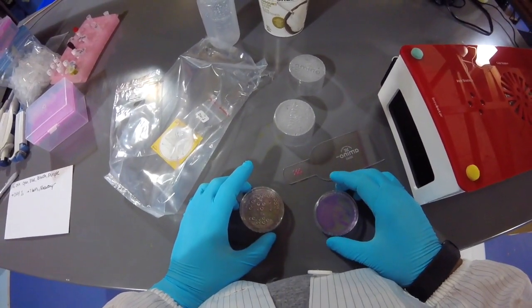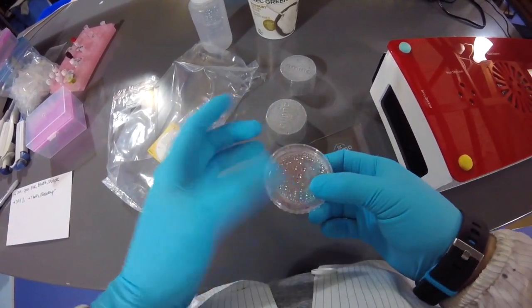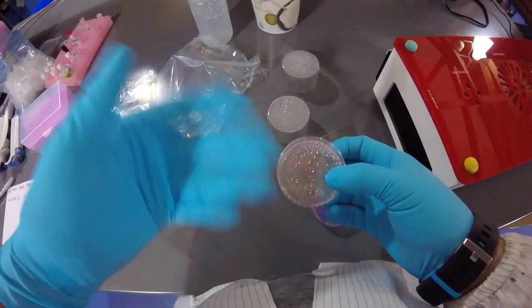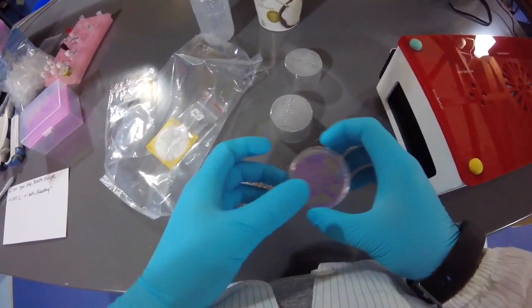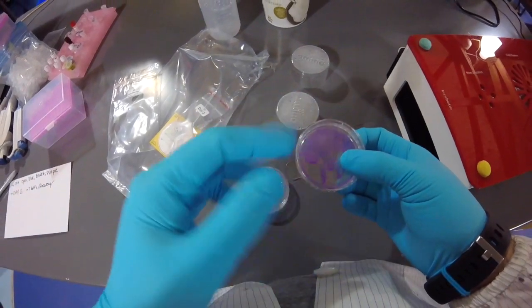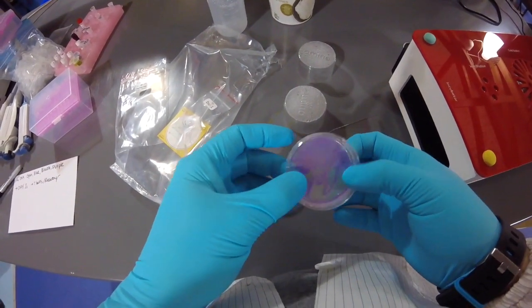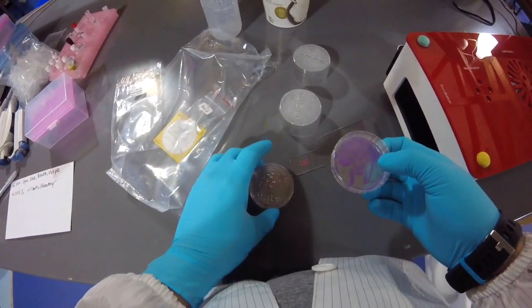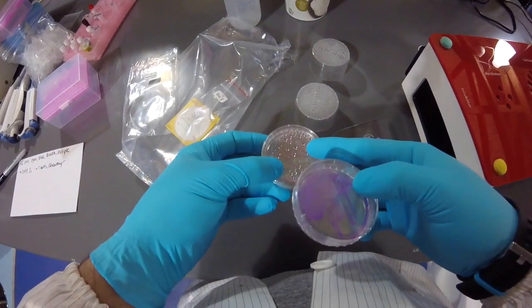And then on day 3, we plated our engineered cells. On one of the selective plates, we just poured about half of our cells and spread them out and then let the plate dry. On the other, we spread out the positive cells. You might recall you got a tube of positive cells. All right, and then we incubated those. We're now at 50 hours, and we get a lot of colonies.